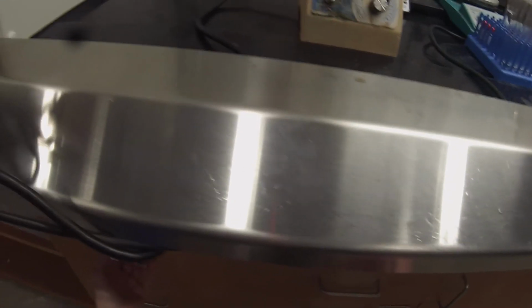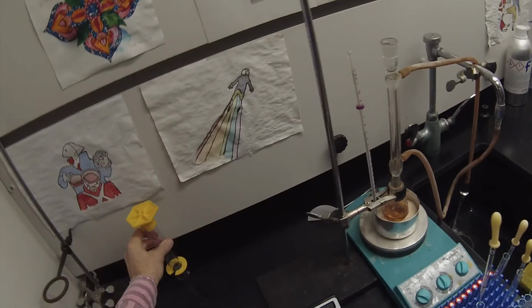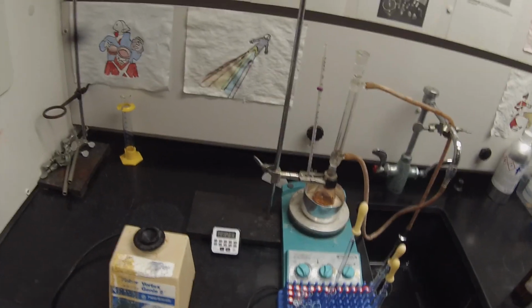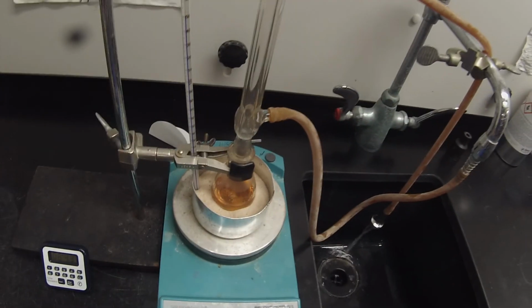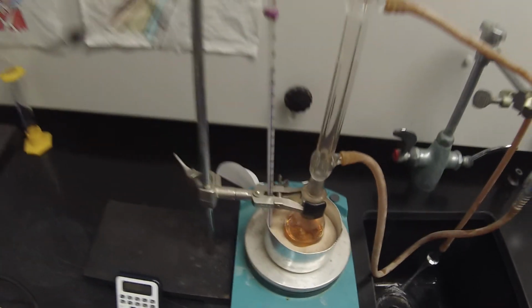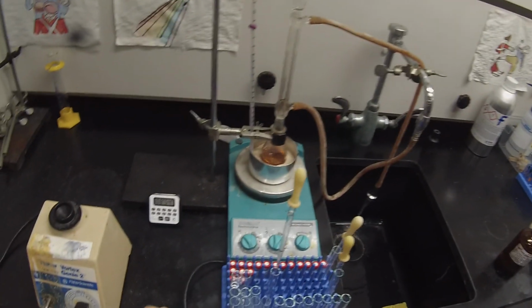Probably dry by now. That's not dry, because xylene takes a while to evaporate. Turning darker. Pretty distinctly orange-red now. And I got 1 more minute for our 10-minute data point.